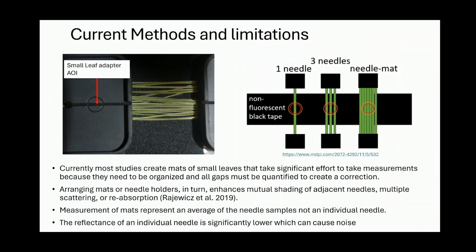That being said, the measurement of several pine needles is going to be the average of several pine needles. And so if you target an individual needle, you're getting a more targeted measurement.